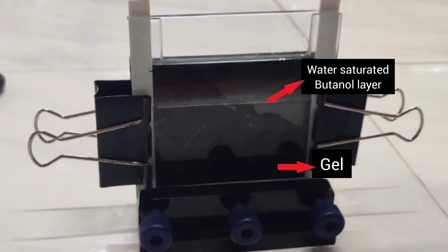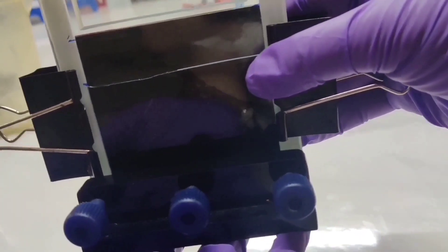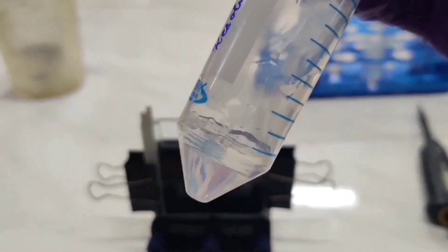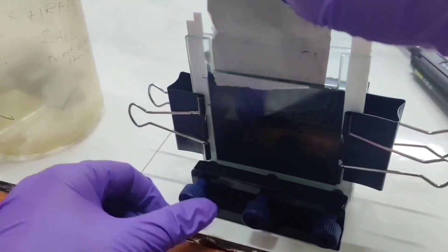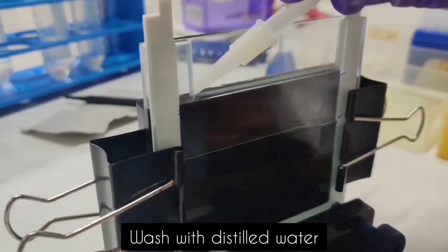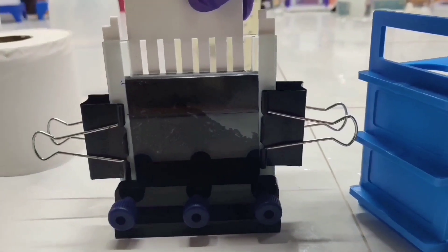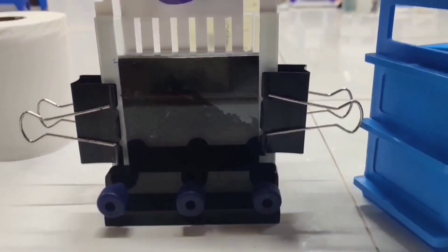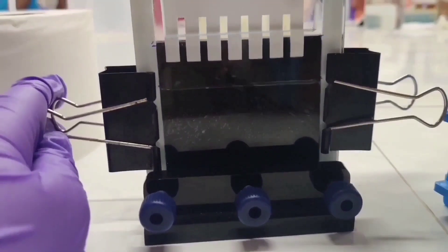We allow this resolving gel to solidify for approximately 30 minutes to one hour at room temperature. We can see that the gel has solidified completely. This can be observed by the gelling of the gel solution in the falcon tube or when a defined line is observed between the water and the lower gel. We can see the layer of the gel and butanol in the setup. Now remove the butanol completely and wash out the remaining traces of butanol with distilled water. Remove the excess water using blotting paper.